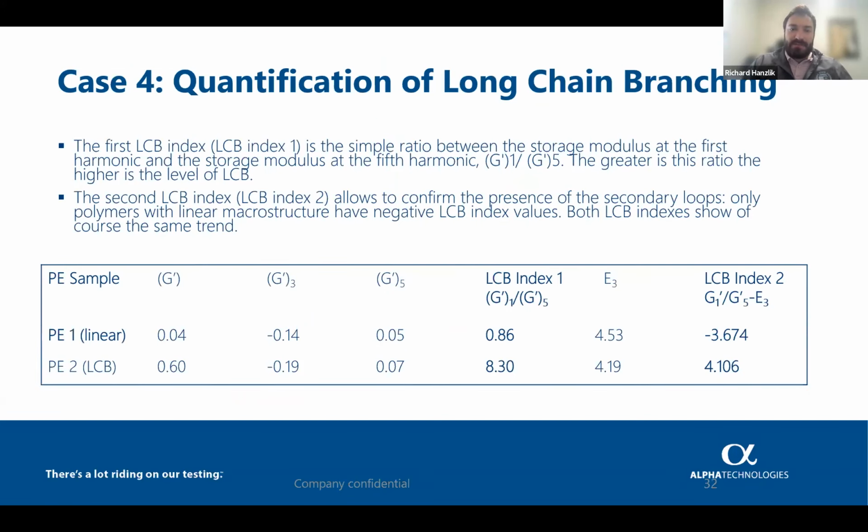And then when we come to our LCB index, one thing that's really nice is that these indices are baked right into the software, so you don't have to plug in these equations that we saw earlier in the slideshow. These are already built right in, and all you have to do is select the data point in your test setup, and it'll spit out this number at the end of the test. So basically, earlier when I asked, are we going to have to do this math? The answer is no. We do it for you.